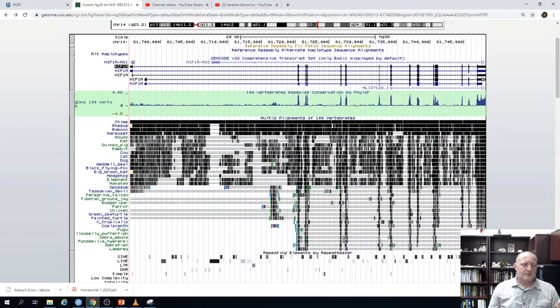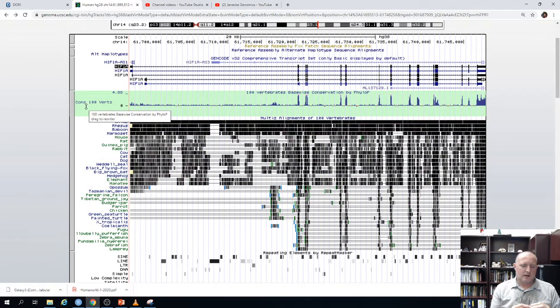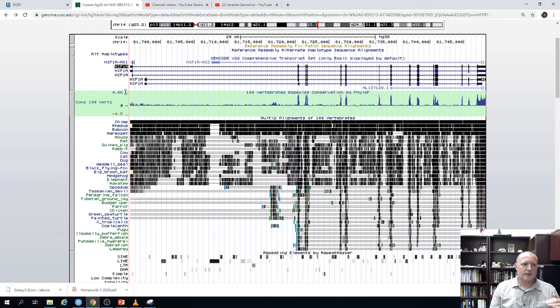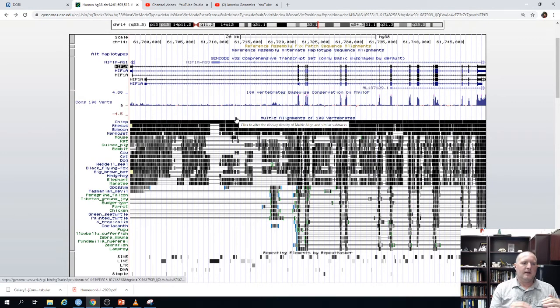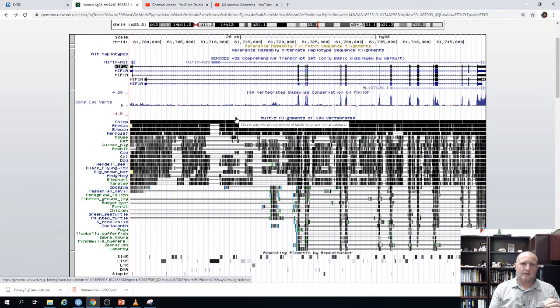Another interesting track is the conservation track. This comes from an alignment of a hundred different vertebrates, and it shows conservation on a scale from 0 to approximately 4.88. The higher the value, the more conserved that sequence is across these different vertebrates. If a sequence is more conserved, it tends to be more functional.